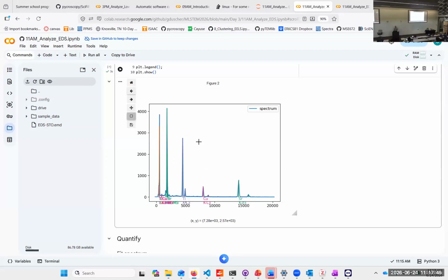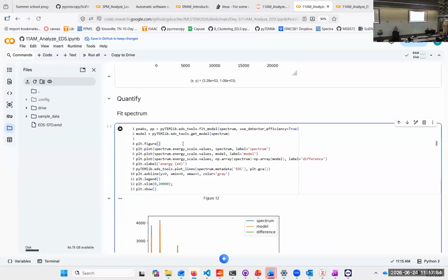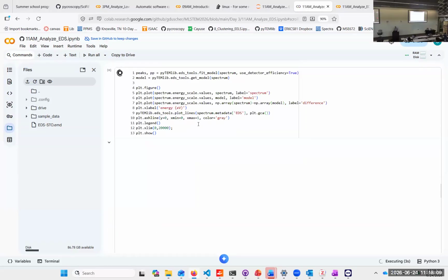With that method, you don't find it because it is one of the low-lying edges of copper that is not used normally. So anyway, it's relatively robust. If it doesn't work, you can always add some kind of materials. And so you can try that. And it depends on how many peaks you're finding in that. That can be a little bit better refined, no question, right?